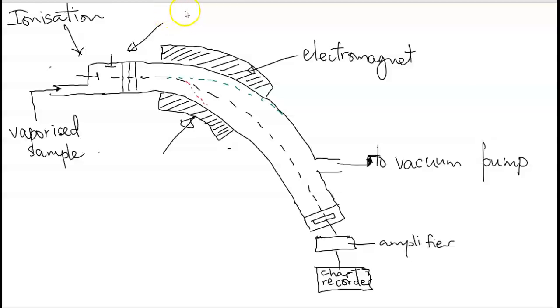After our sample becomes ionized, acceleration occurs, where the ions become accelerated by an electric field through a negatively charged plate. So what happens is that they start traveling at the same speed, and they travel through the spectrometer, where they become deflected. So the next step is deflection.